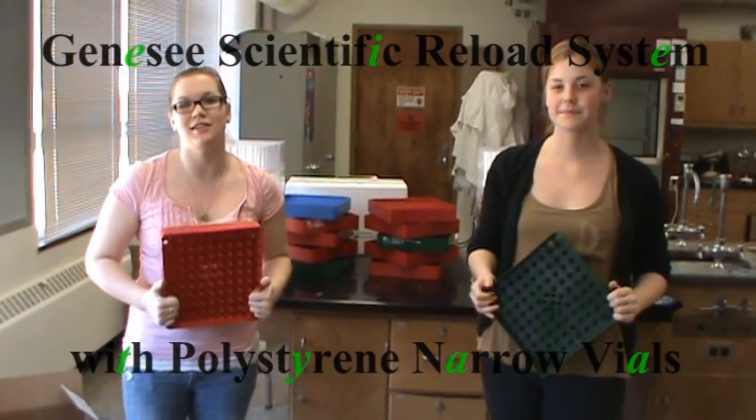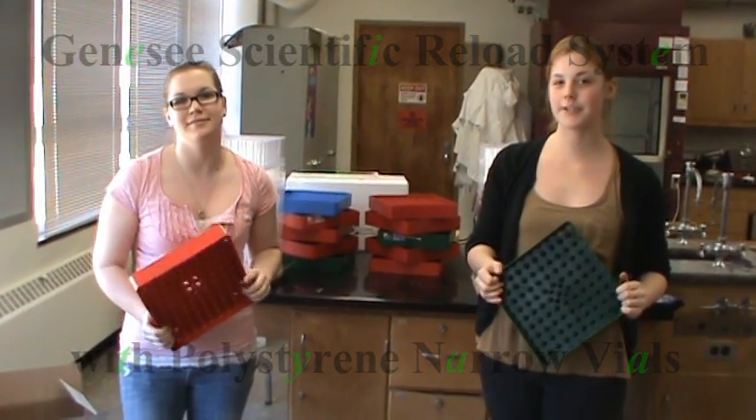We're going to be using the Genesee Scientific Reload System, using polystyrene narrow vials.